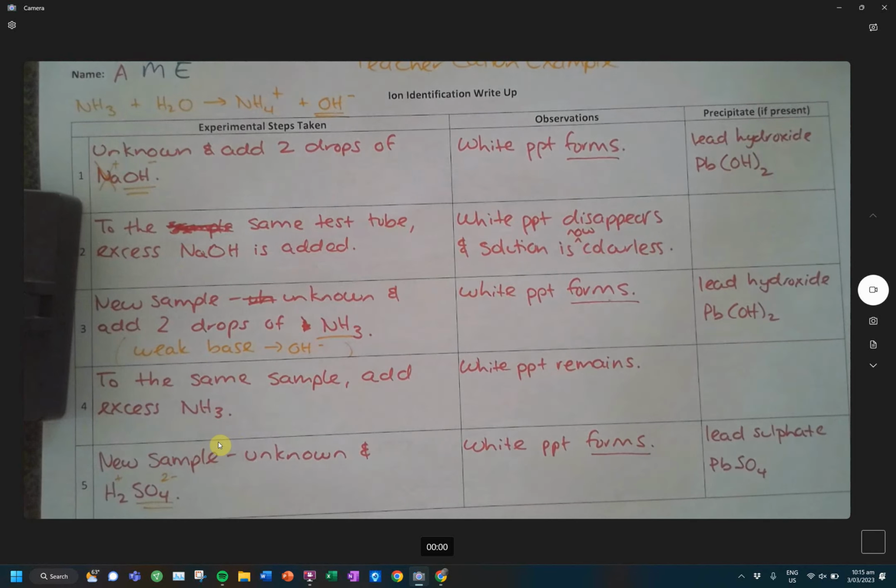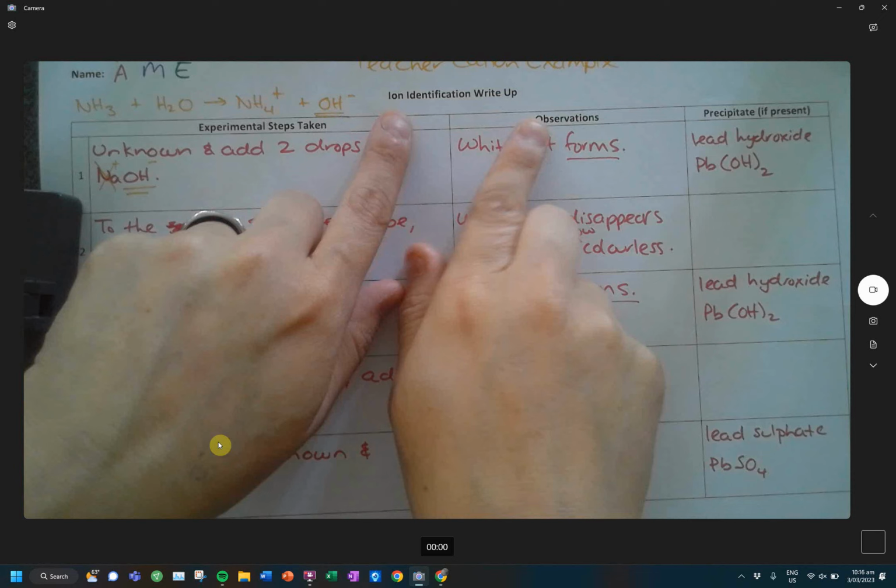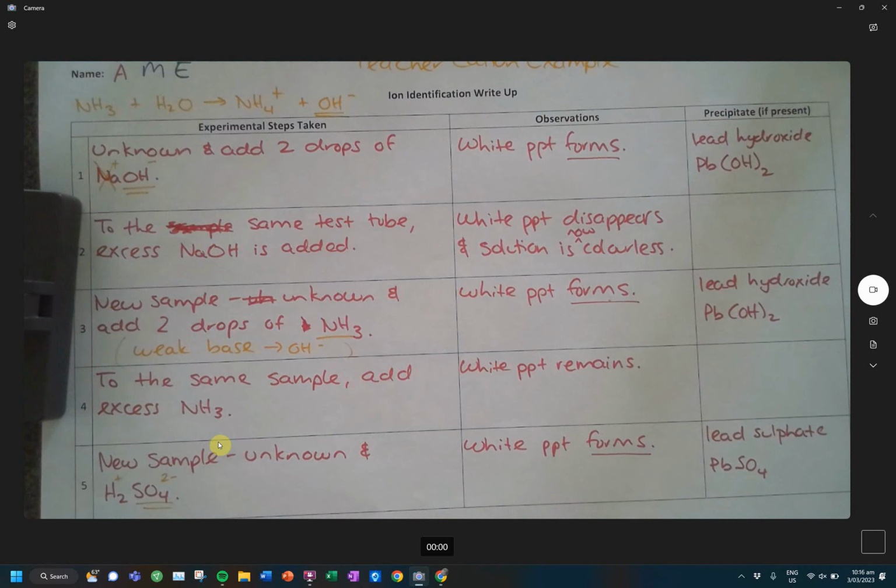A little bit more work because there's more steps when it comes to identifying cations. But same process that you guys were doing before. I will stop it here for now. I will go over the merit and excellence bit so you guys can have the example of that. But I want to give you guys a chance to do some unknowns and identify them. So I'll put 2 more unknowns up. We'll do unknown number 1, unknown number 2. You guys will then also make your own little box as well for identifying cations. Grab, obviously, some more of these template sheets so you can practice the write-up. Sound good? And then goggles and hair up as well. So let's grab all those things.